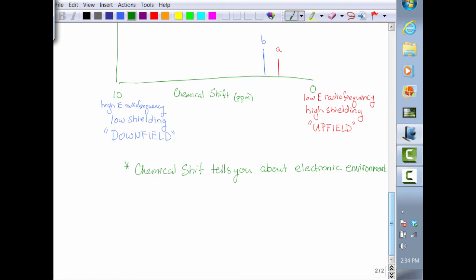So, let's just take a moment here and look at your spectra. Everybody here has some kind of a primary bromide, right? So everybody has a molecule that looks something like there's some kind of an R group, right? And then you have a CH2 group. Can you pick out, just based on the chemical shift, right, this whole R piece is an alkane, so they're just CH2 or CH3 groups.